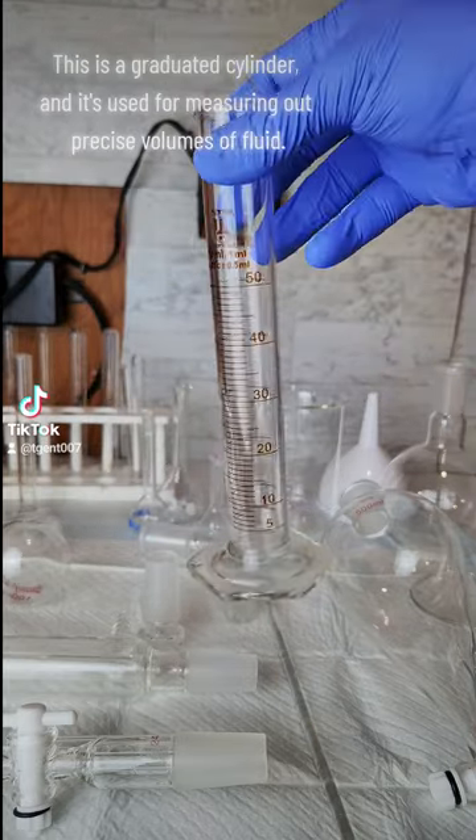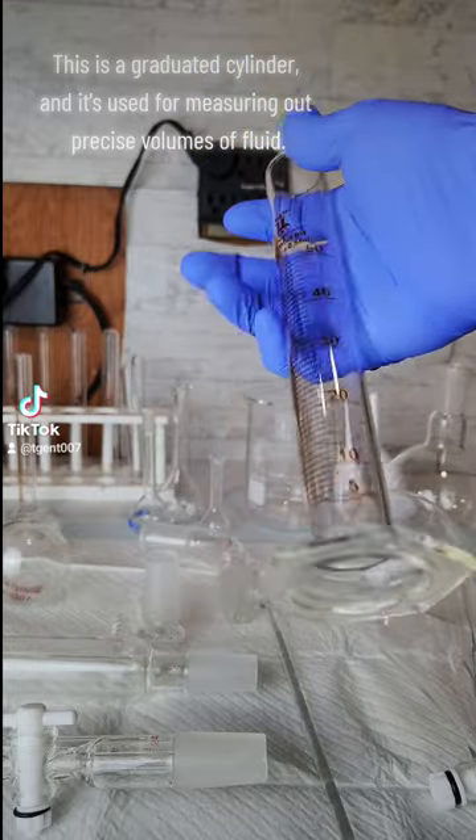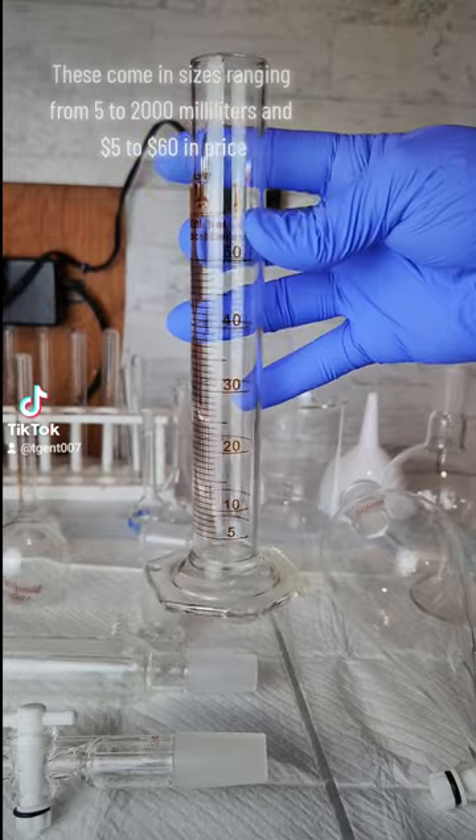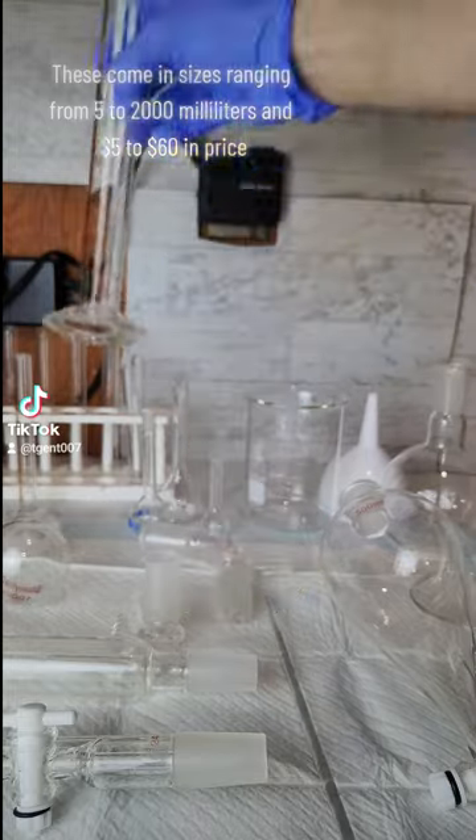This is a graduated cylinder and it's used for measuring out precise volumes of fluid. These come in sizes ranging from 5 to 2,000 milliliters and $5 to $60 in price.